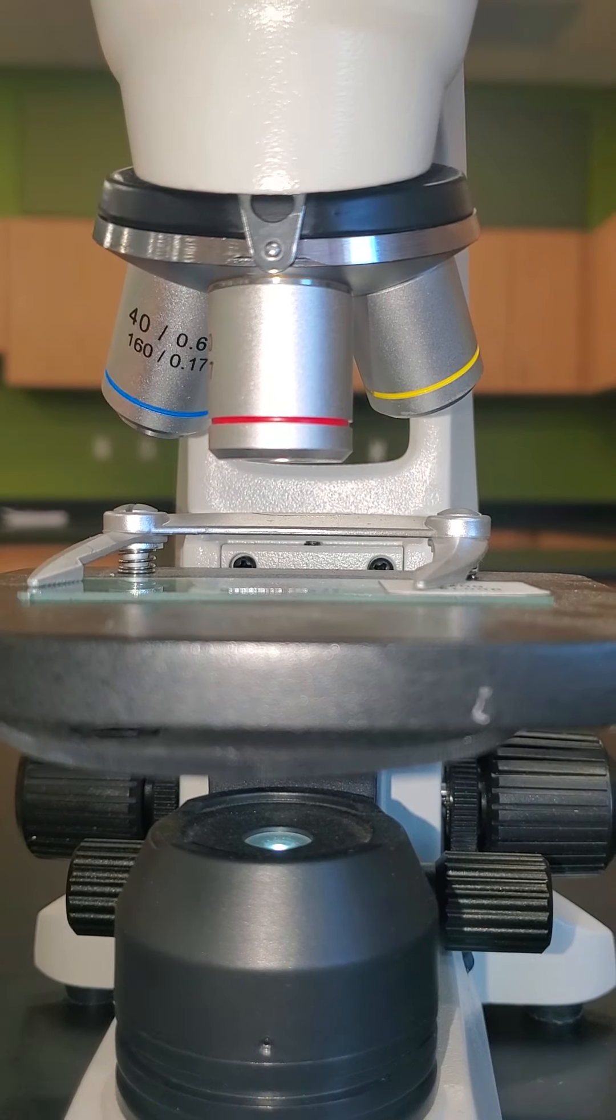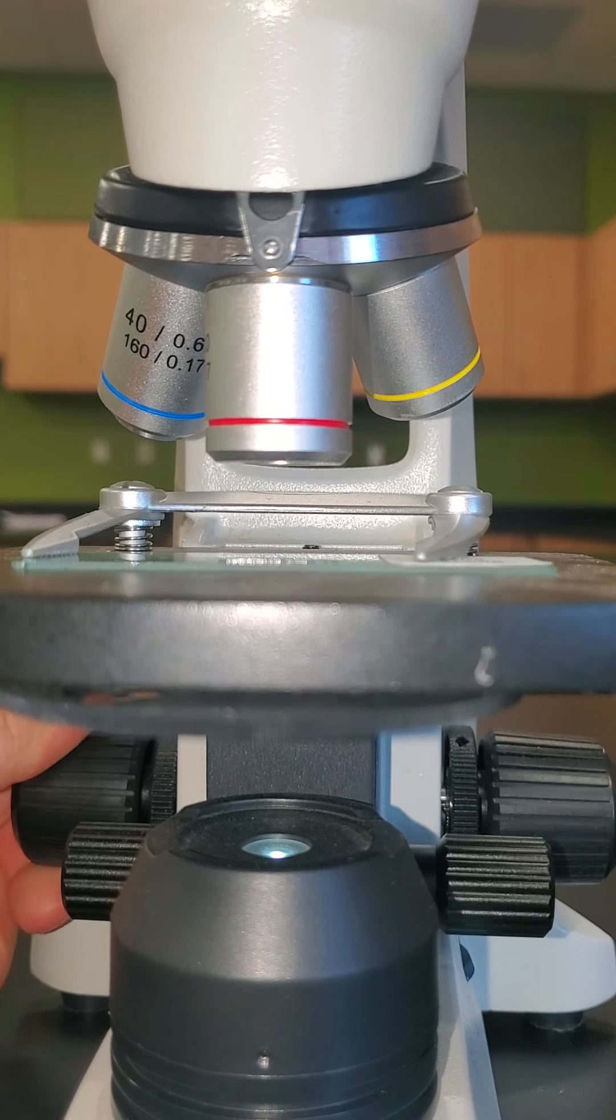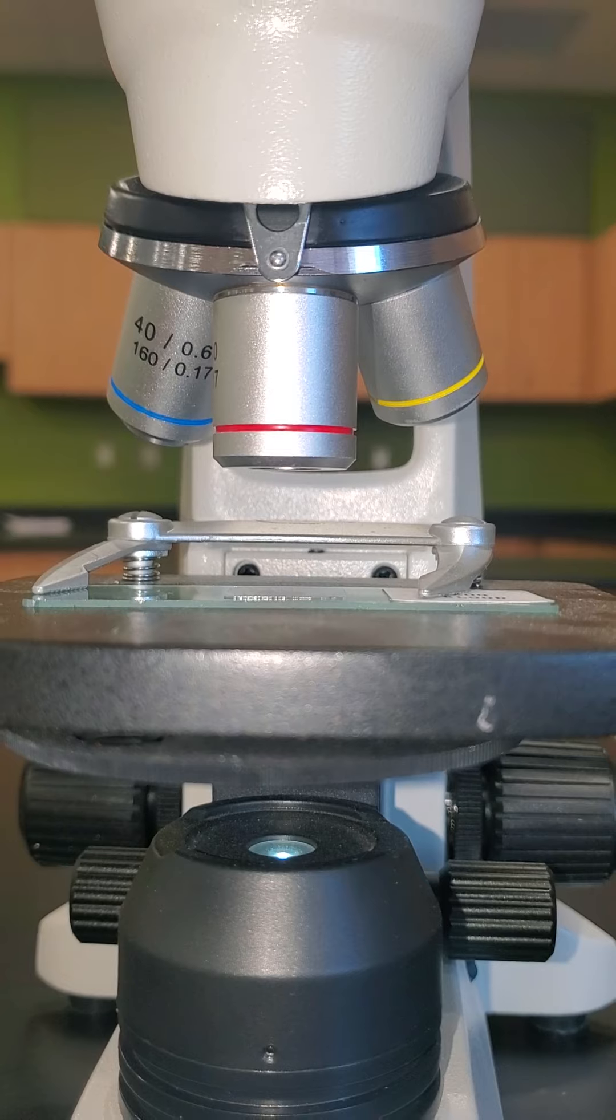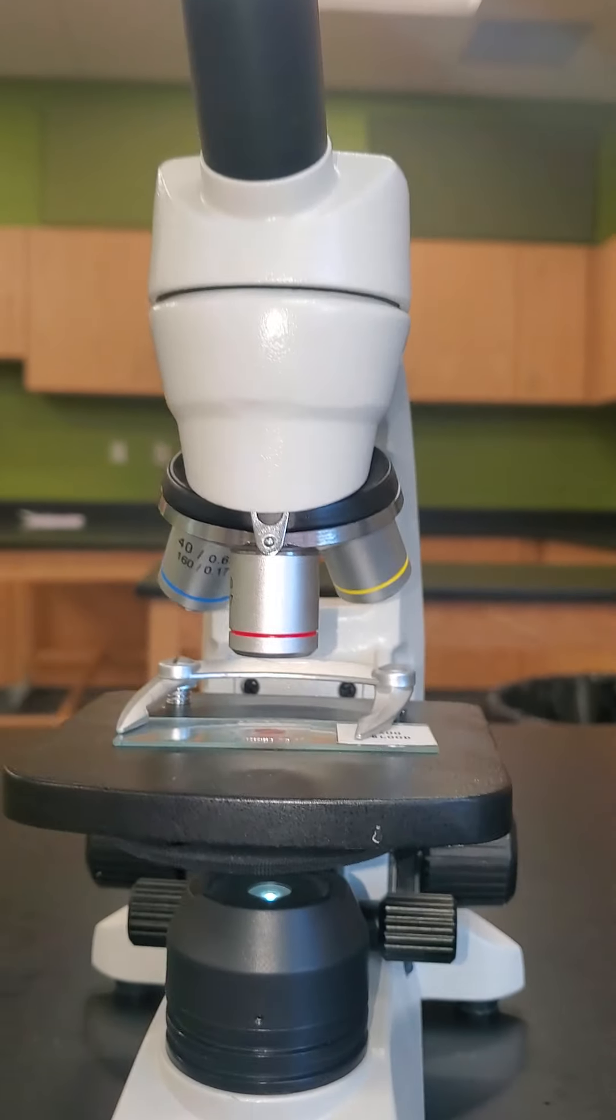Typically with the red lens we don't have to worry about that as much. The red lens is shorter, it does not come as close to the specimen, so we have to pay attention to that.